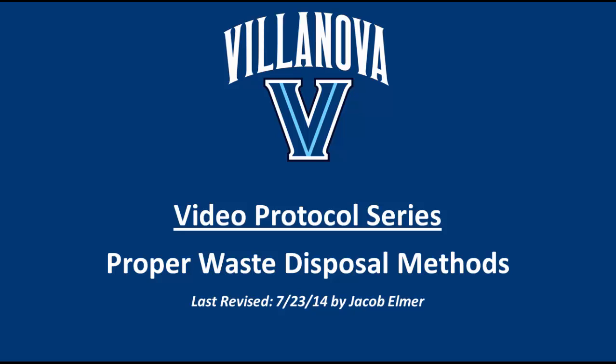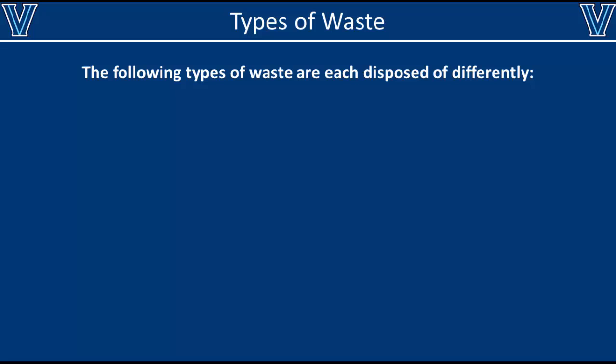Hello! The purpose of this video is to show you how to properly dispose of all the different wastes that you'll generate over the course of your experiments in the lab. Indeed, there are several different types of waste that you may generate in the lab, and each one of them may need to be disposed of in its own unique way.